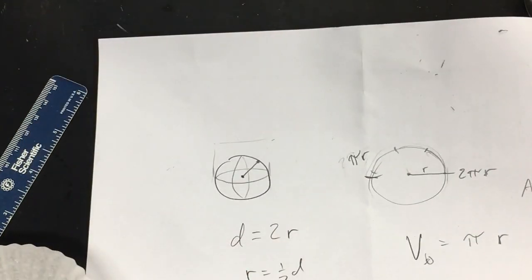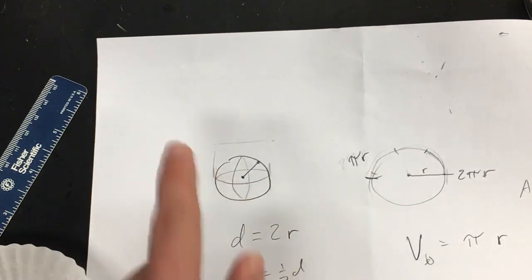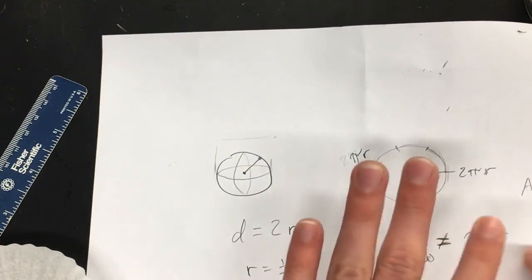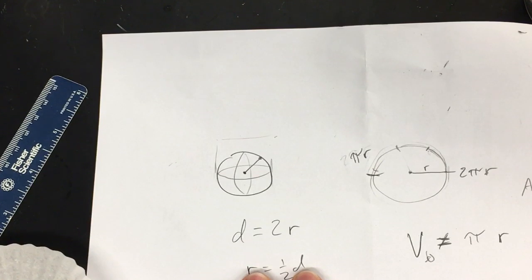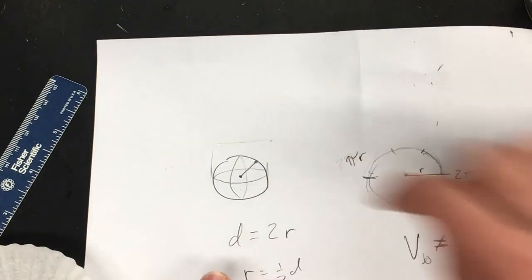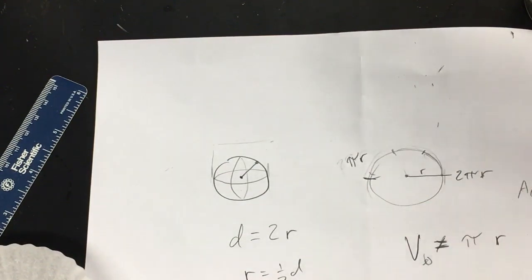So express that measurement we took, or the data sheet will be giving you, and express that diameter in radius. Look up the expression. This is not the equation, but it will involve pi and radius, and something will be squared, maybe even 4/3, I want to say. And plug it in, and then figure out what the volume of your sphere is in cubic centimeters. Well, a cubic centimeter is 1 milliliter, so that's kind of the meat and potatoes of what we're getting to here.